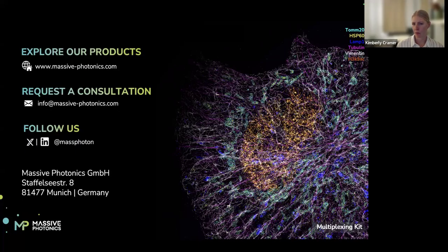This could be very valuable if you're trying to do some sort of spatial proteomics approach like they did in the neurons, or if you want to see the mode of action with, for example, monoclonal antibody conjugates. I think it will be really good with that, and I think it definitely will move towards this area.